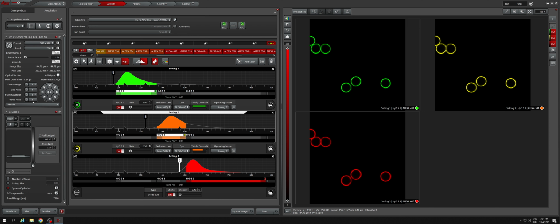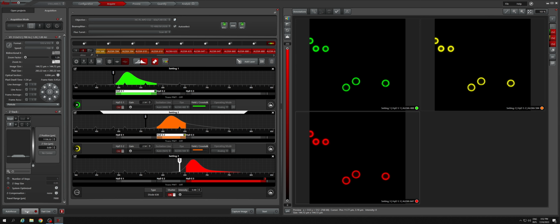So now what I'm going to do is just stop that and then set up my Z stack settings over here. So let's just turn on live again. And what you need to do is basically focus all the way up or down, or basically up until you don't see your sample anymore, pretty much.